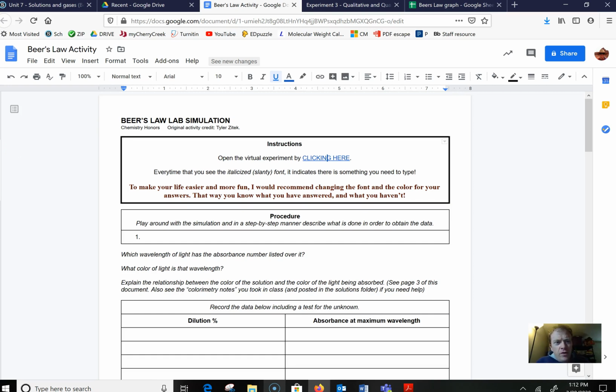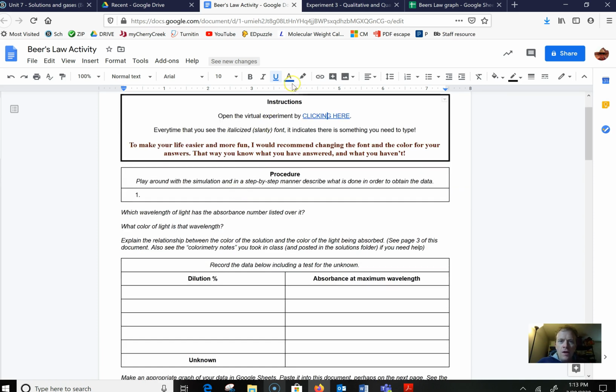Hello there everyone, this video is to offer a little bit of help and walk you through the Beer's Law Simulation Lab a little bit. In the case of my class, we did this in real life and with real solutions, and depending on what class you're in, some classes got farther than others. But as a review, we're going to do this virtually, so there's a simulation online.